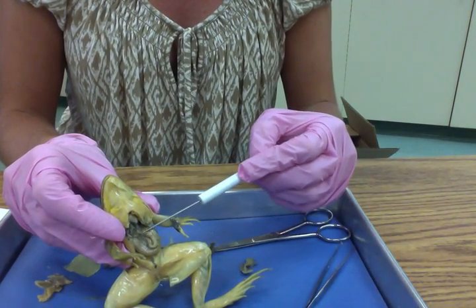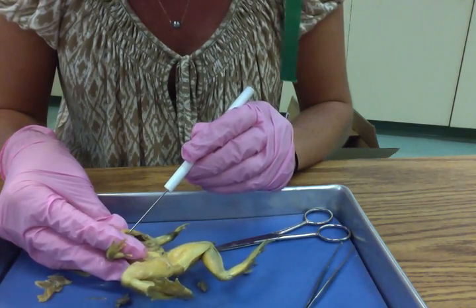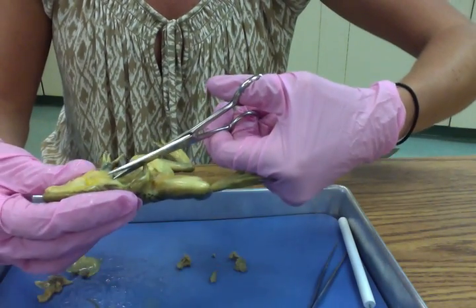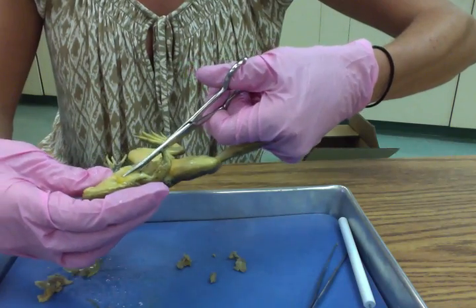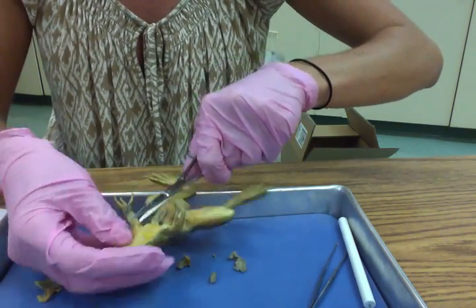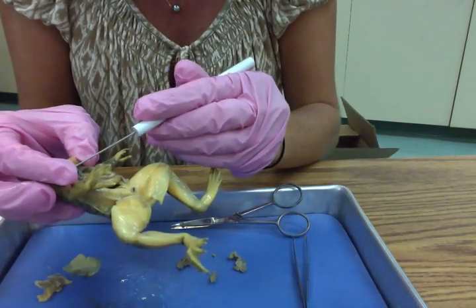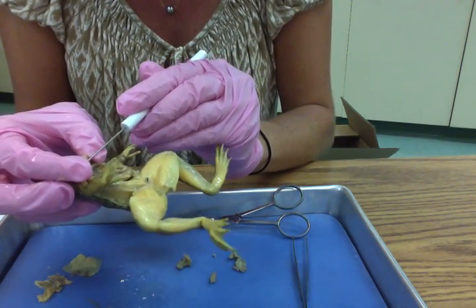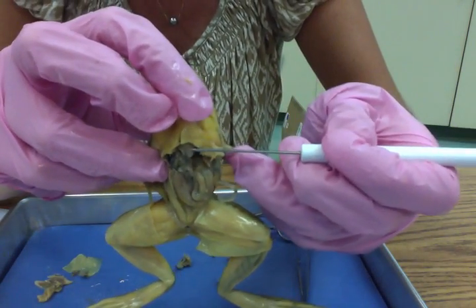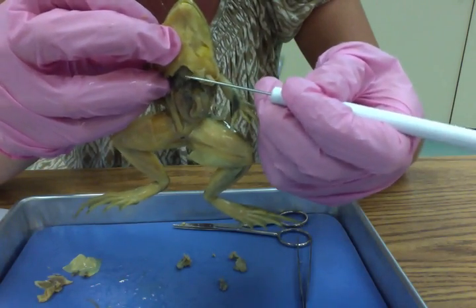Anterior to the liver, or to where the liver was, so anterior meaning towards the head, we're going to see the little heart. So you may have to pull back some of that skin, maybe cut a little higher. So this structure here, just below the center of the frog's head, is the heart.